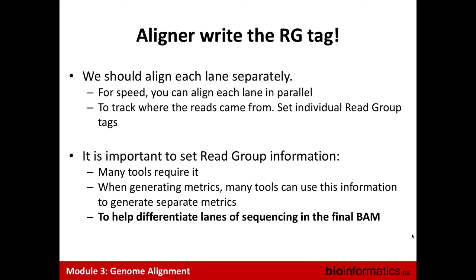If you see the pattern is present in every read group, that means it was present at the beginning in every sample, so it's probably a biological effect that you see on your reads. If you see that only one of your experiments shows this weird pattern and not the others, that means it's probably a technical issue in this experiment. So it's really important for each experiment to keep a tag that you can use to track back where the read comes from.